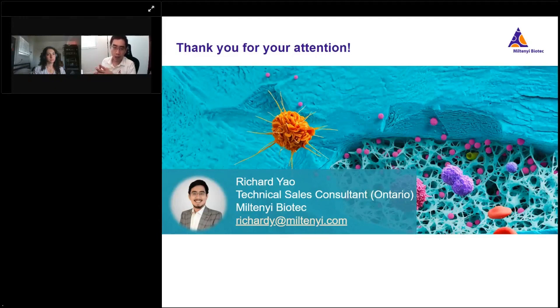So as a result, for the CD34 ultra pure beads, like I mentioned in the slide, in terms of the CD34 percentage among the total PBMC gating checked by flow, the purity is very similar. But the major advantage of the ultra pure beads is that if we check the total forward scatter and side scatter gating on the flow cytometry result, we can see that aside from the PBMC, at the debris section, when we are using the ultra pure beads to do the extraction, there is significantly less debris in it.